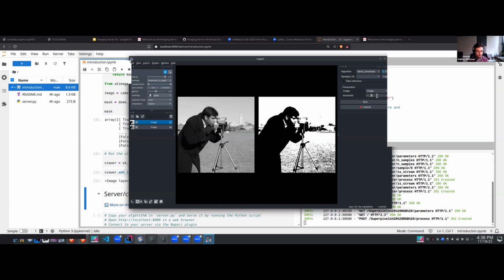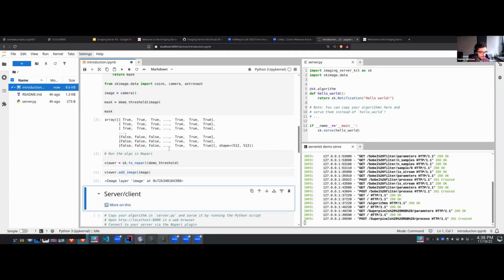Or to set a value of a threshold above 255, which is the maximum value for this image. And also, I would like to have the threshold update when I change the value in the layout. So let's try to make these improvements.